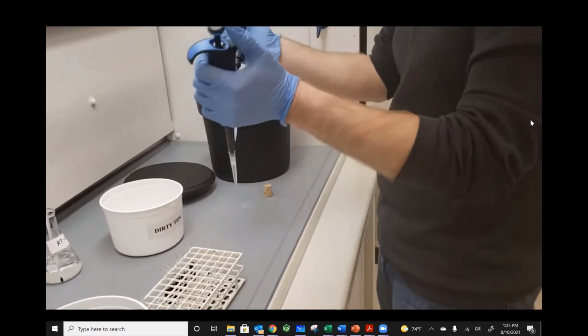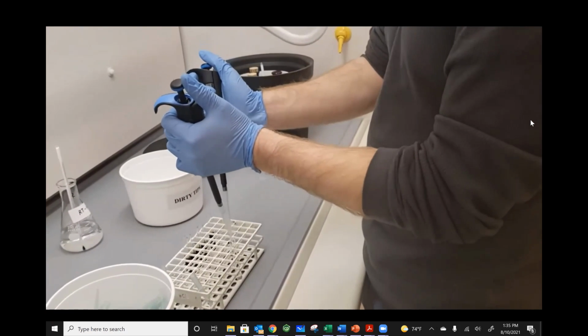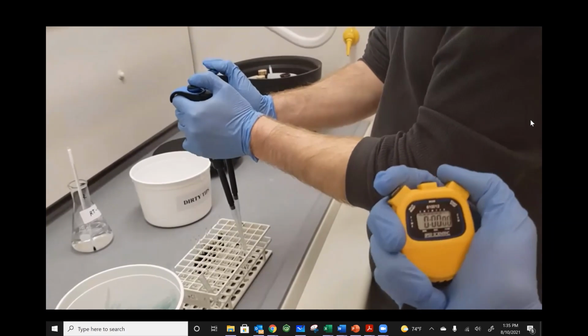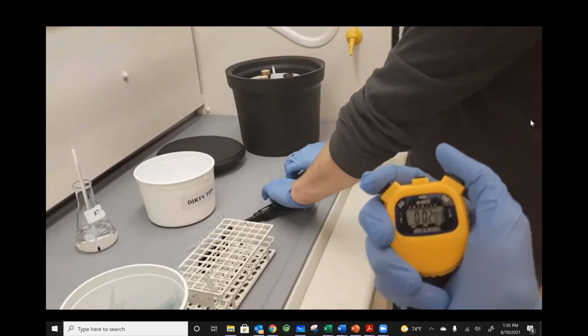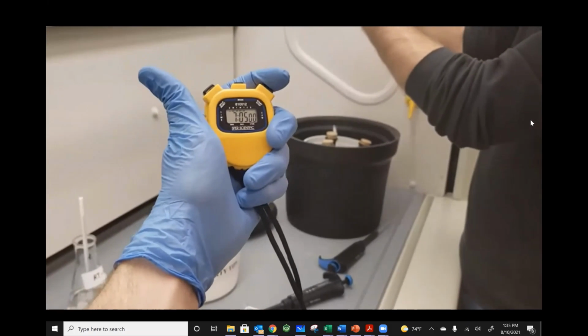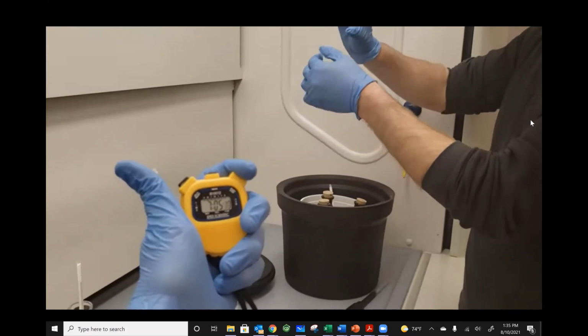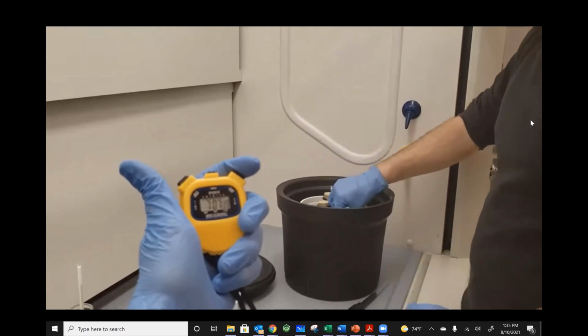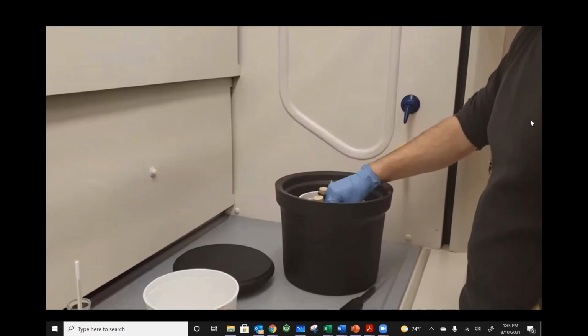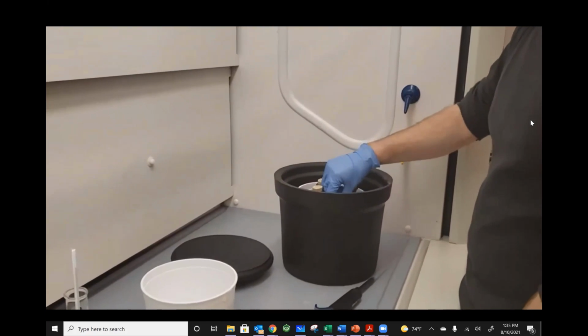All right. Ready to go? And go. Oh, never mind. Start it up again. This is why agitation is important. So we'll add 1 second on.